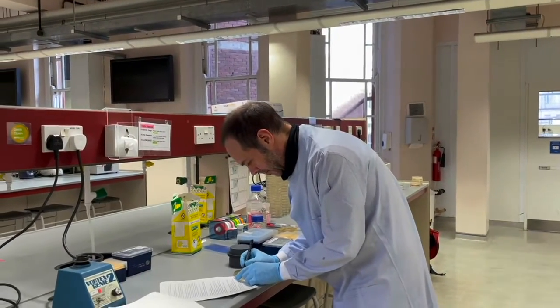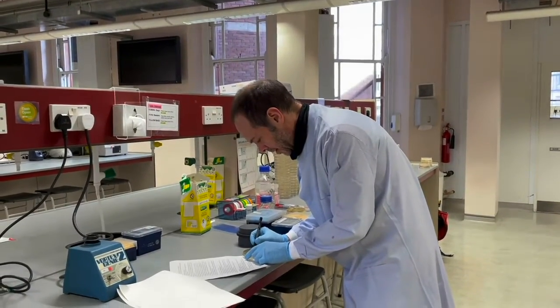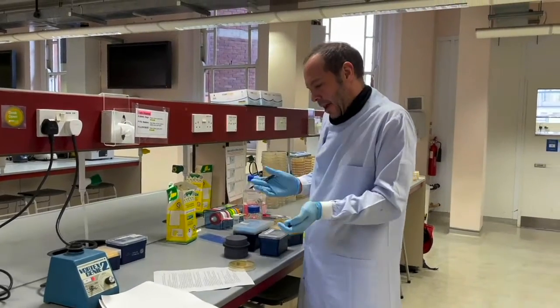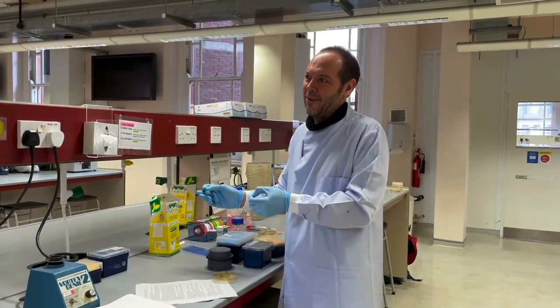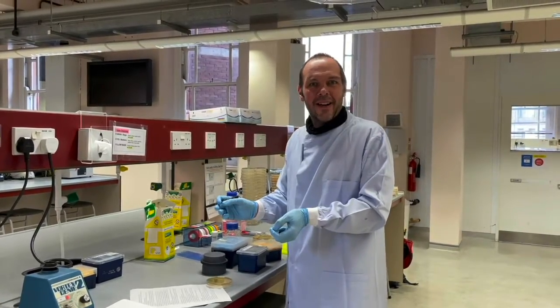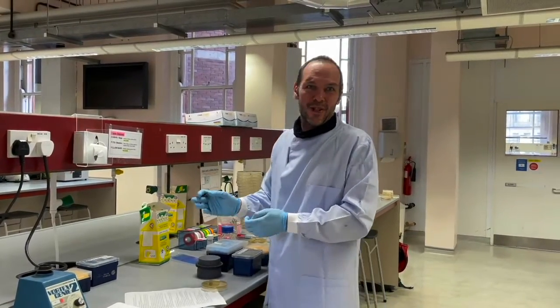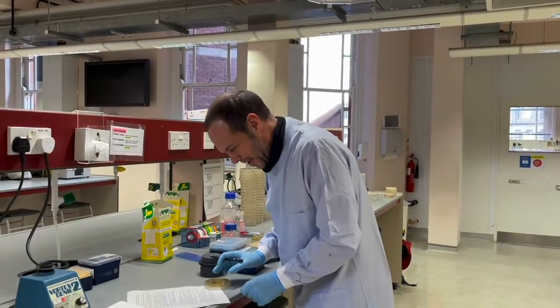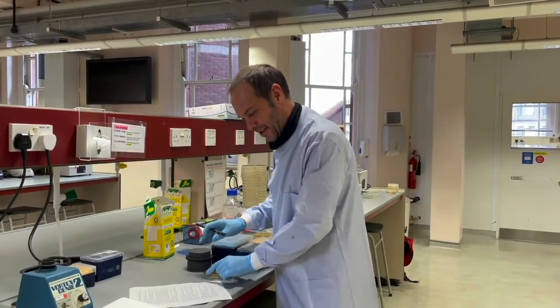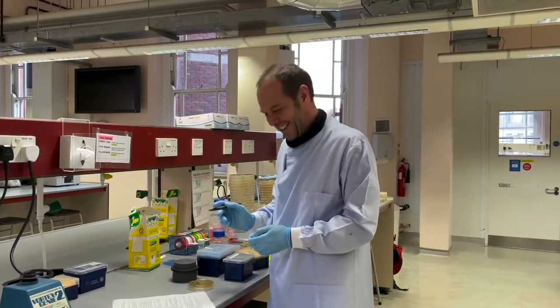It is like striking a match in a way, a similar action. It is, I think, and that's why it gets mixed up. Some people do say striking the cells, and therefore it's struck, and some people say streaking the cells, and therefore it's streaked. But when they get muddled up, then I'm just like, what? Okay, this is good. Let's think of some more themes.